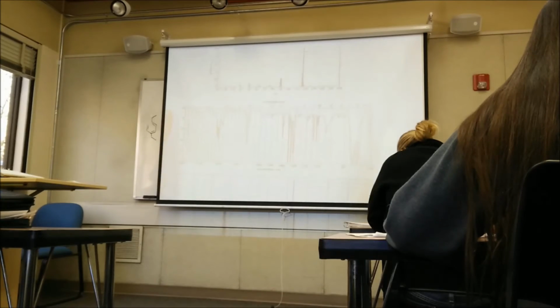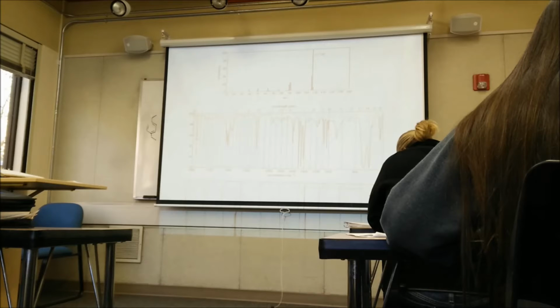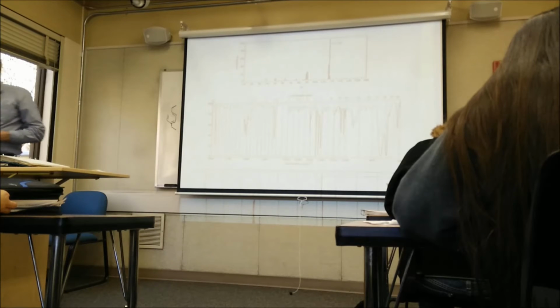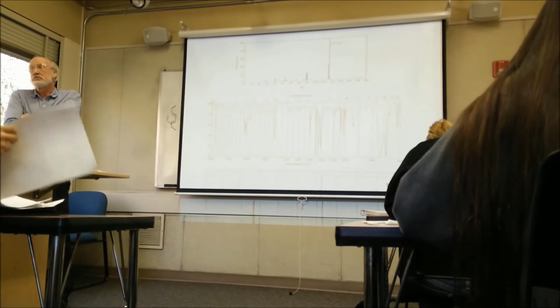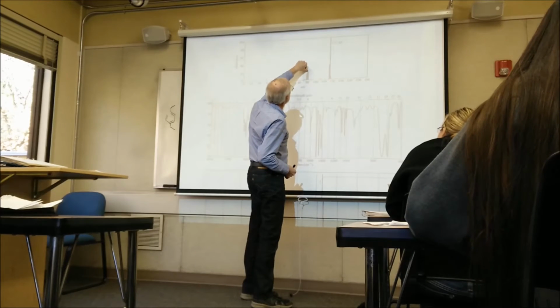This is complicated. I know. There's an N plus 2. But no, we have to have, yeah, we've got an odd M plus peak at 117. Sounds like a nitrogen, an odd number of nitrogens. But the nitrogen would have to have some even fragments, and we don't know. Well, this is a little hard to read, but there's clearly a fragment at 90, probably that middle one.